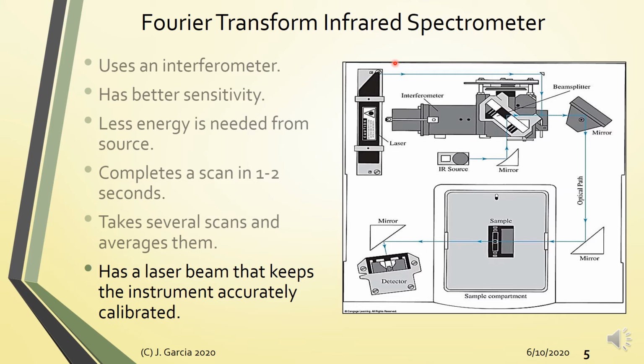Importante na non-condensing and not greater than I think 70% RH. You can also double check, pero mga around that value yan. All right? So if you exceed that value, okay, mako-corrode yung mga lenses and mirrors mo sa iyong instrument.